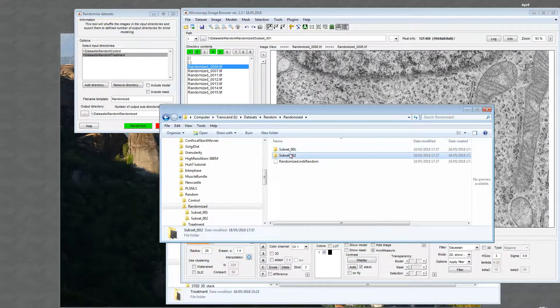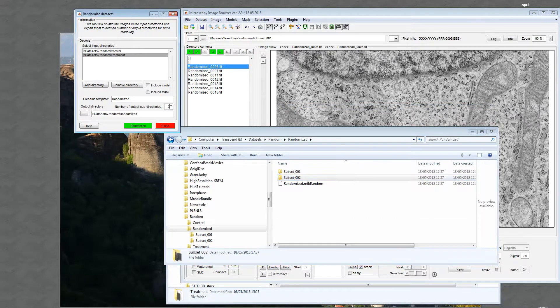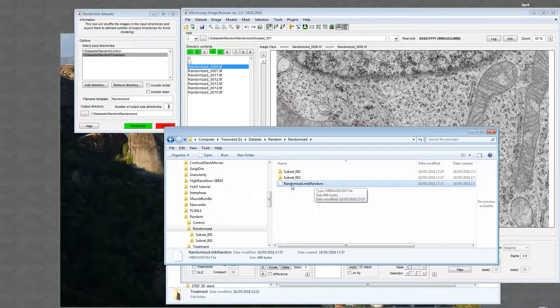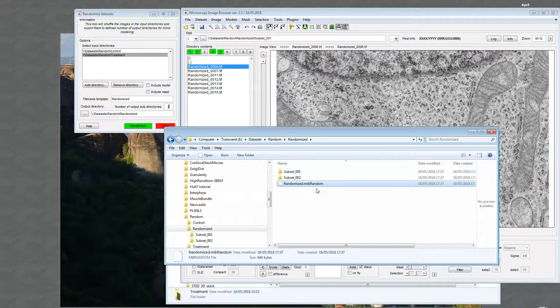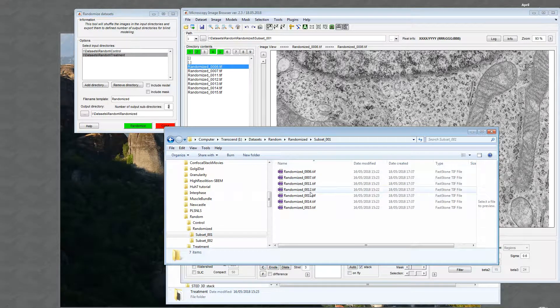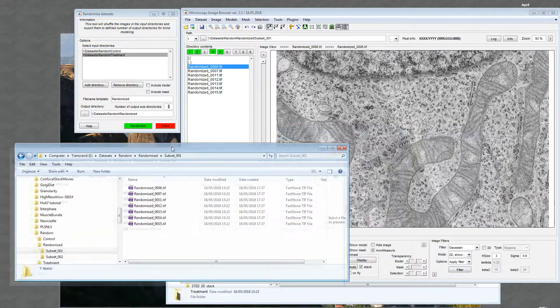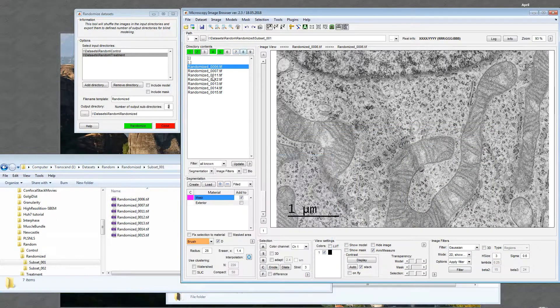The result folder contains the two subsets, defined by the subfolder parameter. There is also a very important file which contains all information about how the files were renamed — the folders, file names, and the visual images — needed to restore the models back later.